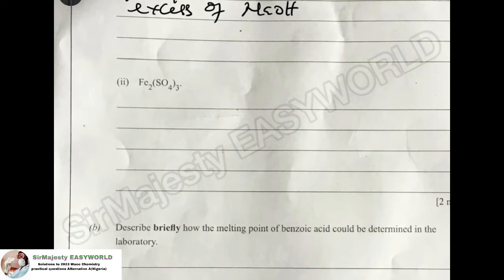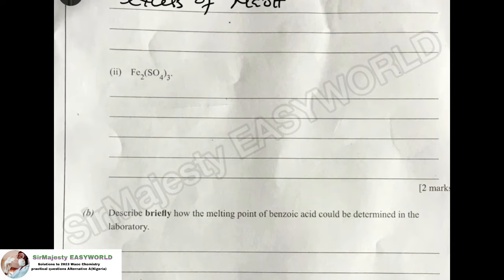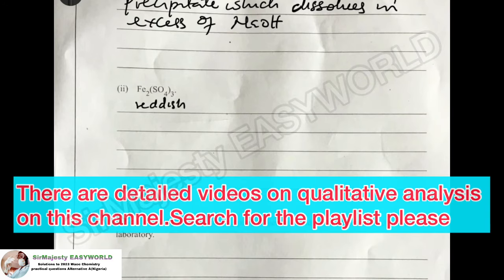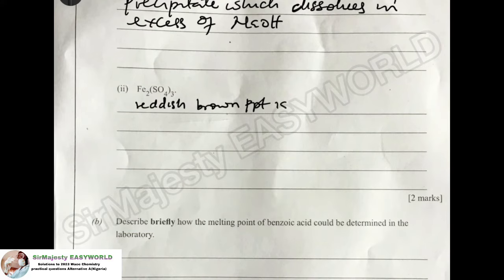This is actually iron 3. This is not iron 2. This is iron 3 tetraoxosulfate 6. If you add sodium hydroxide to it in drops and in excess, there will automatically be a reddish brown precipitate. Reddish brown precipitate is formed in drops, which is insoluble.